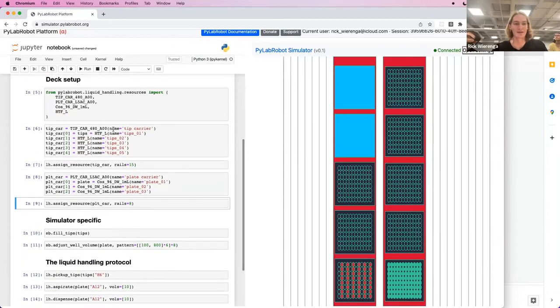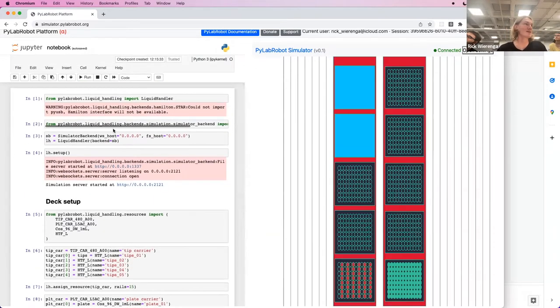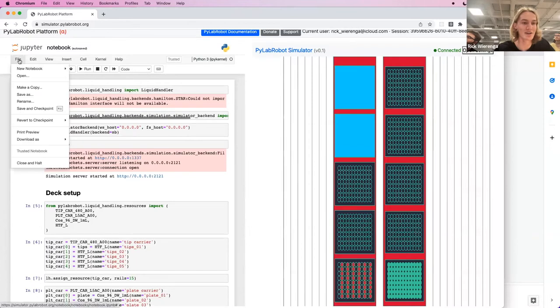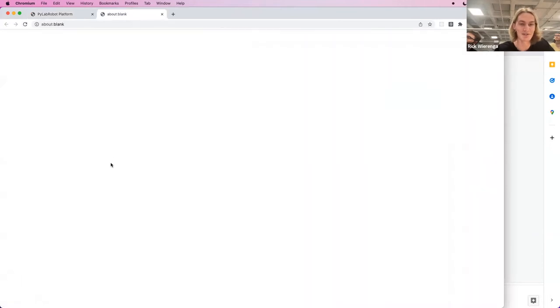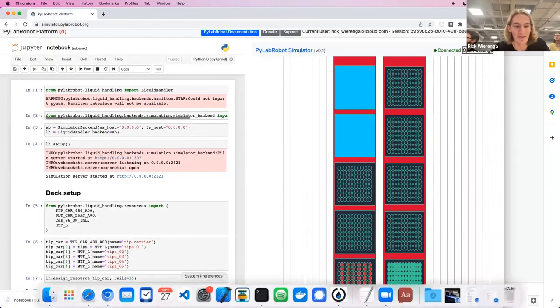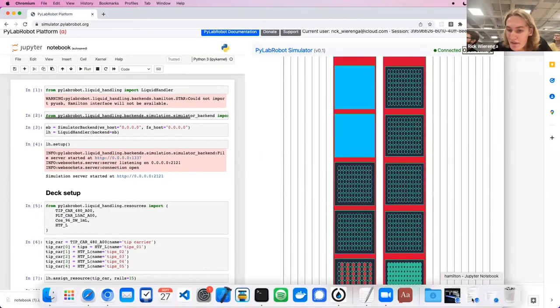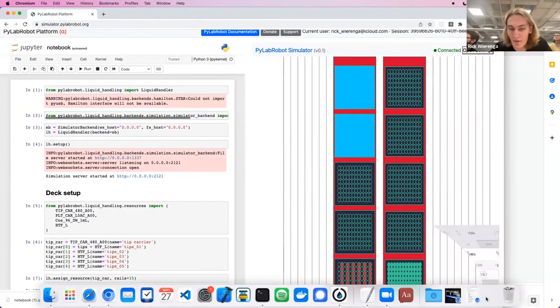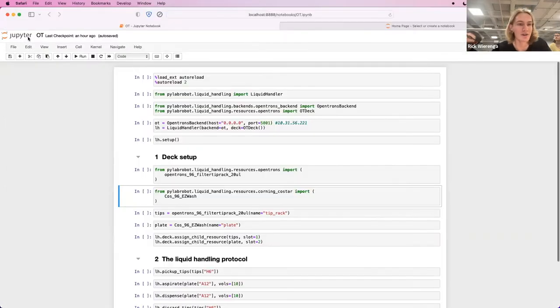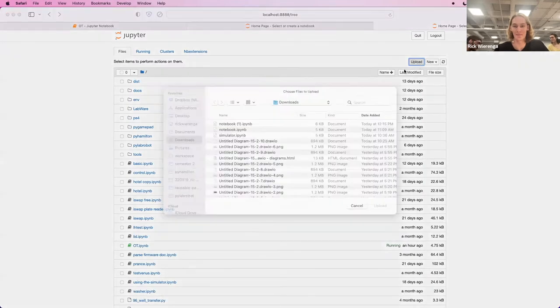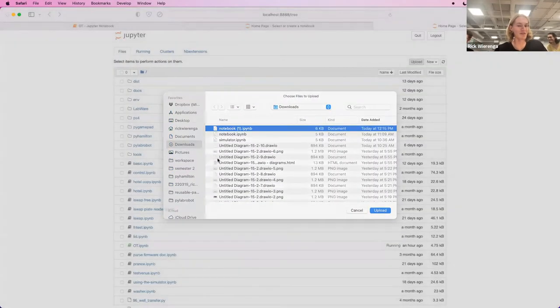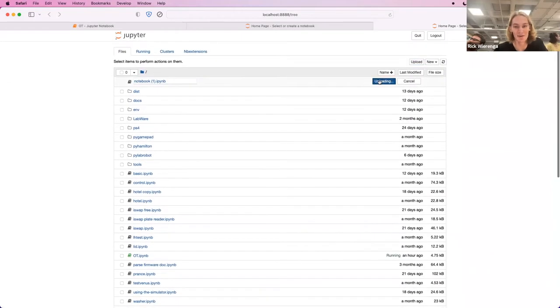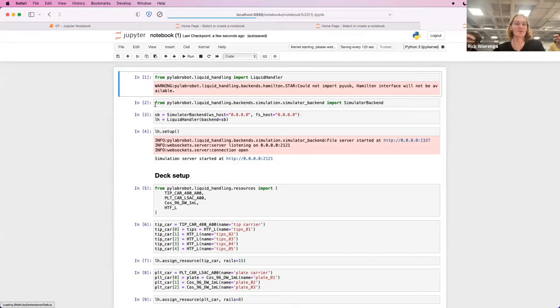All right. So when I have written this method in the cloud, I can actually go and download this notebook. And then on the OpenTrons, for which I have a notebook here, I can upload this file, which we have just written.